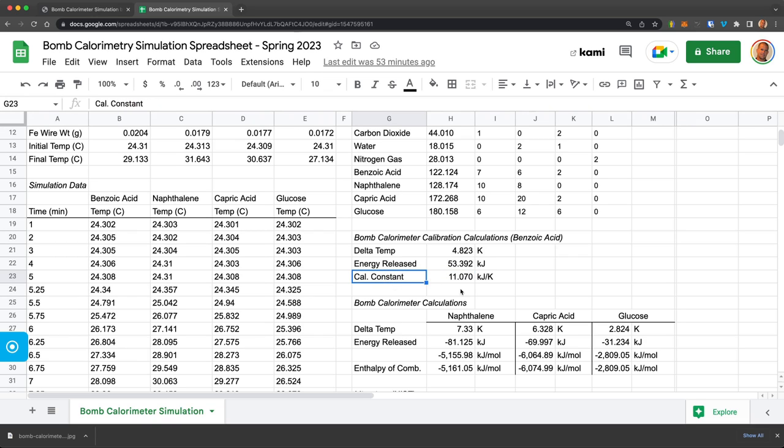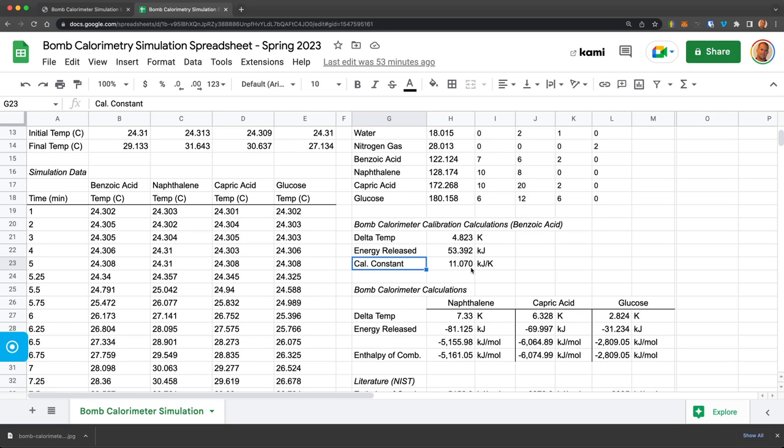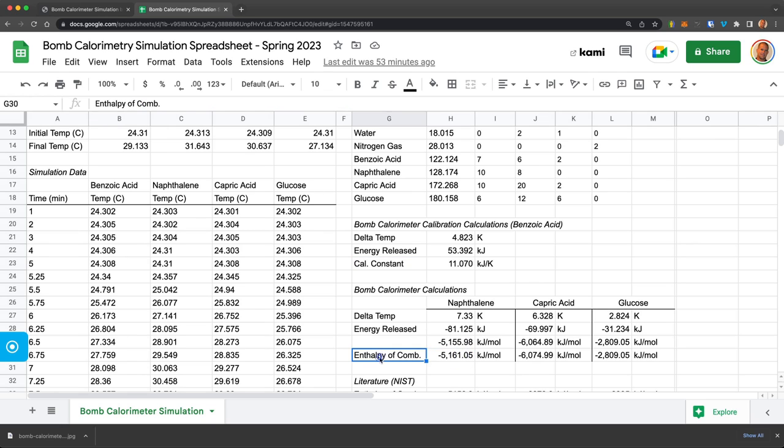And then I used that same calorimeter constant, which is the same while you stay in the same browser and do a series of measurements. It will change every time you reload it. But I did these all at once. And I measured naphthalene. And then I could use that calibration constant and get the amount of the change in temperature, which is related to the energy released, which is related to the enthalpy of combustion.